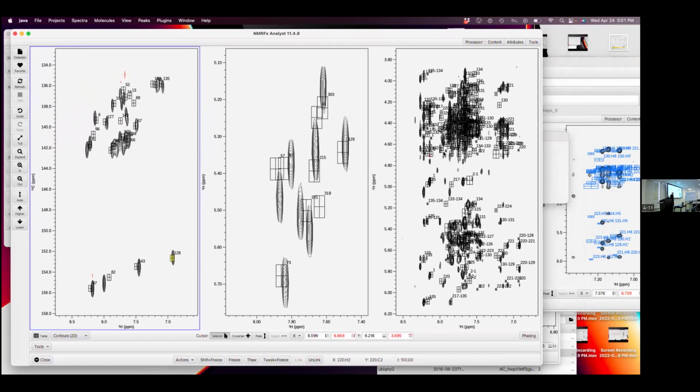But you always say, well, if I can sit and slide this peak and look at everything else sliding in place, then the computer ought to be able to slide it for you. There are some things here which don't really work yet, but I think they're actually in the GUI already, performing these matches. So we're working on some more automated things.